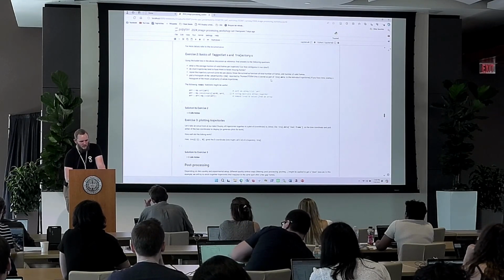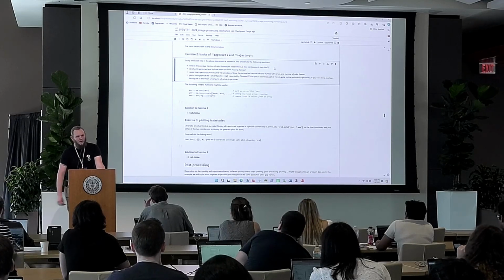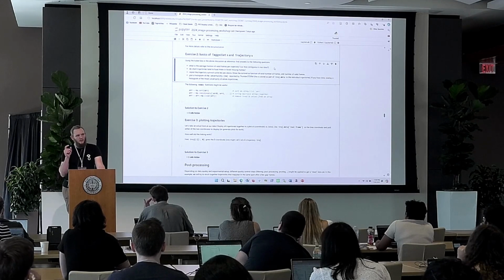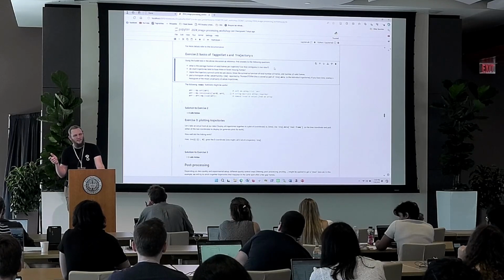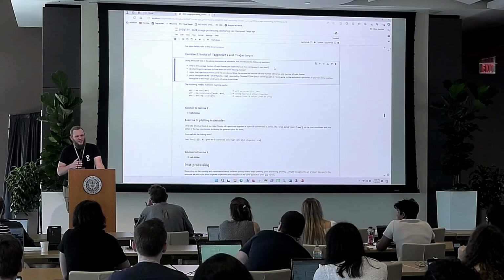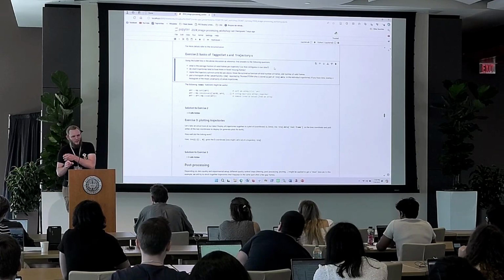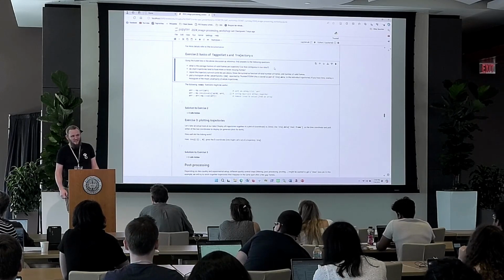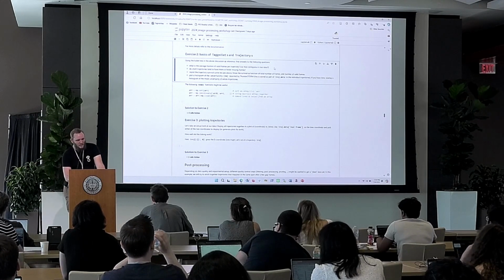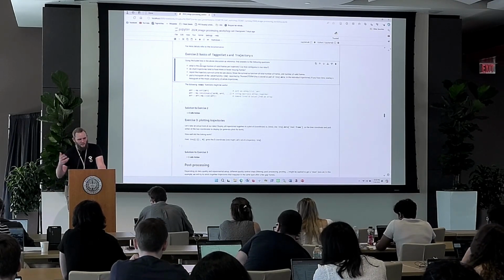what our data looks like. So what's the average fraction of valid frames per trajectory? Our linker allowed gaps in trajectories of a maximum length of 2 frames. But if our data consists of trajectories that have 1 localization, gap of 2 frames, 1 localization, gap of 2 frames, 1 localization, gap of 2 frames, that would be kind of unfortunate. What we're really hoping for is that these gaps are not particularly common. That's the idea of this first question, to check how many frames in the trajectories are actually missing.